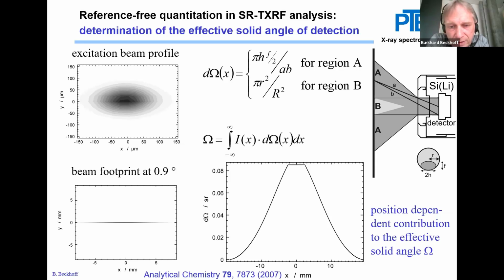If you put the pattern of aerosols impacted, for example, by the cascade impactor, in a diameter that is lower than 4 millimeter, you're not affected. If the deposition pattern is larger, you have a reduced efficiency, but not necessarily a reduced quantification reliability, as long as you know the location of this deposition pattern and its orientation.